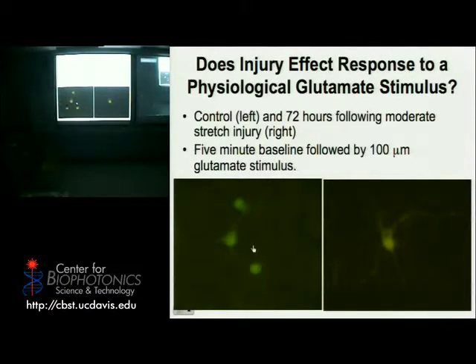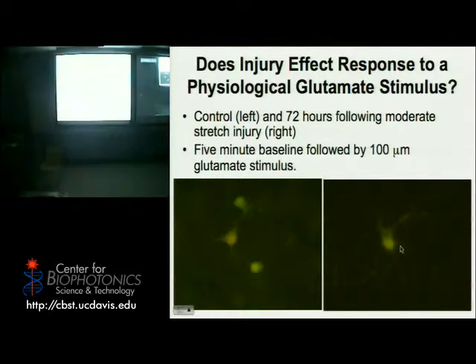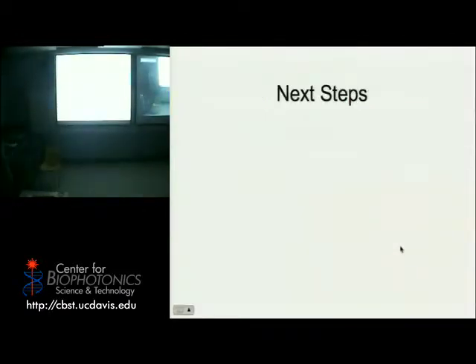And what you'll see is the cells go very green when they're activated. There's no injury. That kind of makes sense. On this side, what you'll see is it's kind of red with little green, and after the injury, nothing really happens. So that cell failed to respond to the 100 micromolar glutamate. So I haven't done any treatment on this. This is just a cell that happened to survive the injury, rather than a cell that maybe would have died, and then I saved and went on.